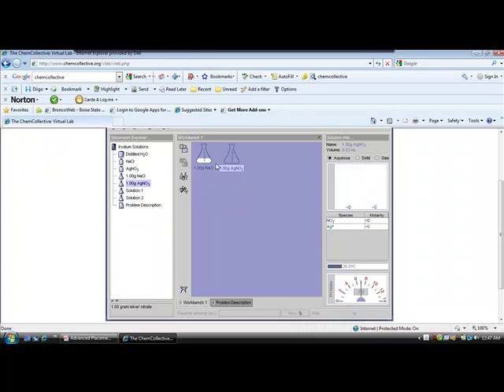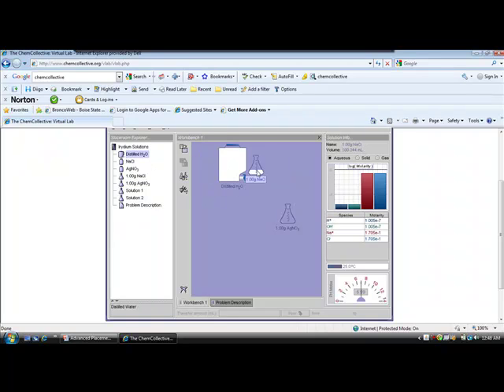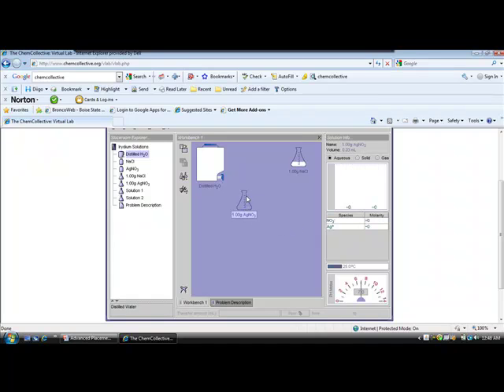Notice it's different than the sodium chloride. The sodium chloride, I can see I've got something in the container. It tells me I've got 1 gram of silver nitrate, but I think I need to do something to it. I need to add 100 milliliters of distilled water. So I come up and get my distilled water container, and I like to keep my distilled water container up here. Now I want to get 100 milliliters of water from that distilled water container into that flask.